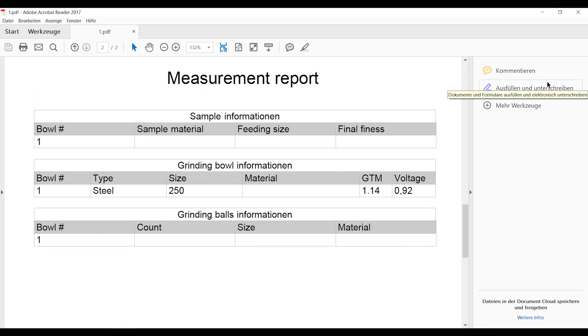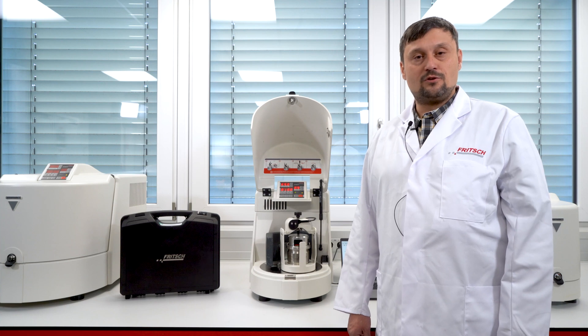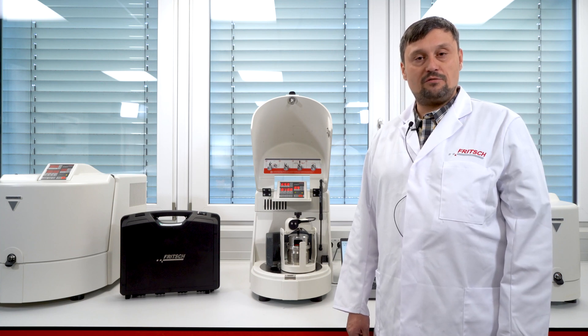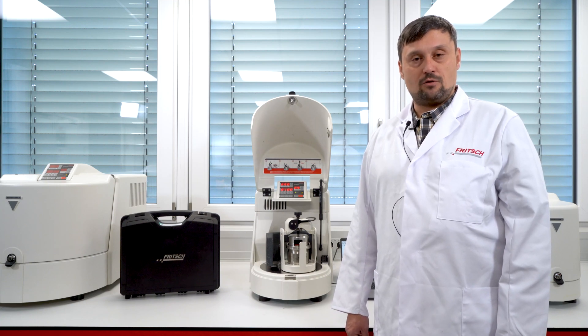With the EZ-GTM system and the Fritsch Planetary Ball Mills classic line, you turn your device into a scientific tool to monitor pressure and temperature during the grinding. Thank you for your attention.